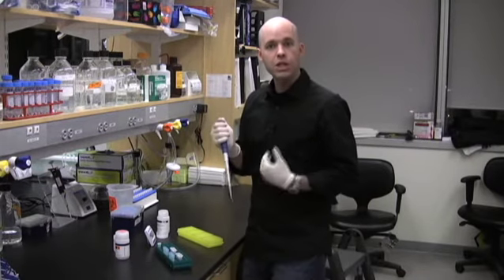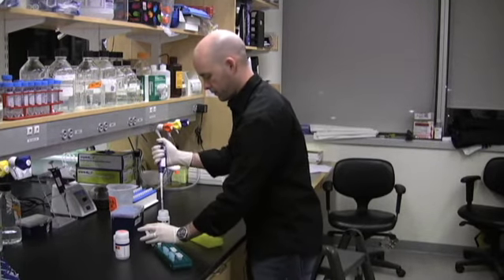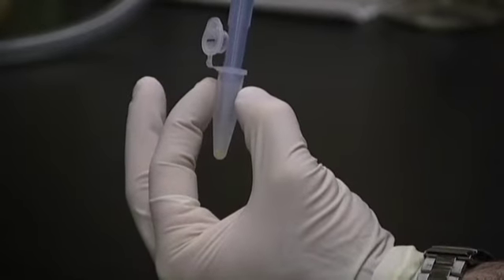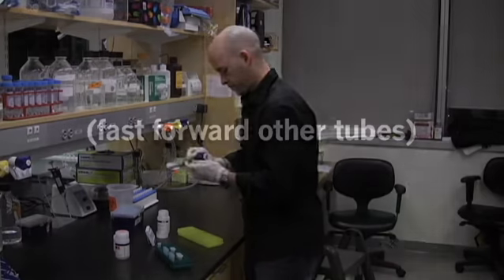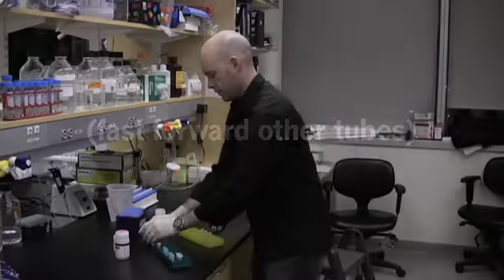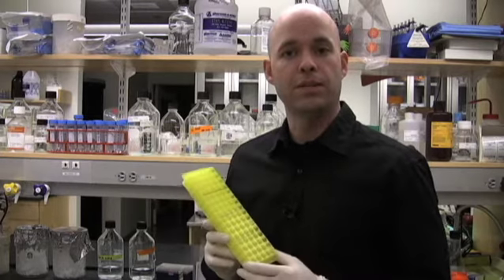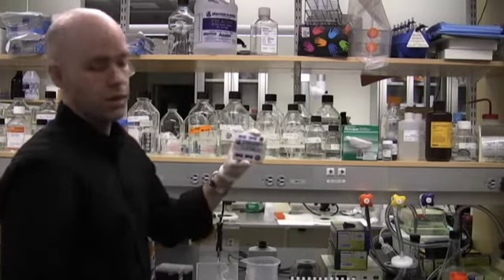The first set of samples we're going to do the traditional way by pipetting each pellet individually. That took 43 seconds. Now we're going to compare that to our tip and see how much faster it is to re-suspend bacterial pellets using an epi-rack. That was 30 seconds.